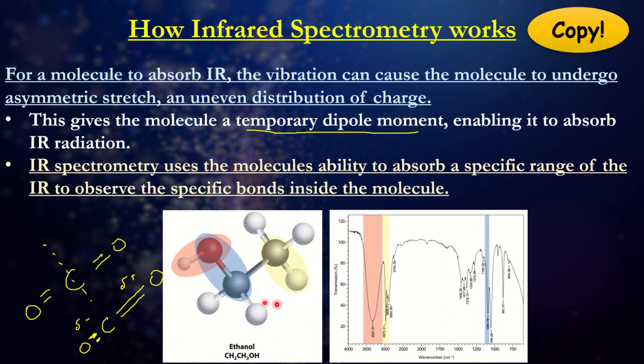The carbon-hydrogen bond relates to this particular spectra here, the oxygen-hydrogen bond, the hydroxyl group, corresponds with this spectra here, and the carbon-oxygen bond corresponds with this component here.